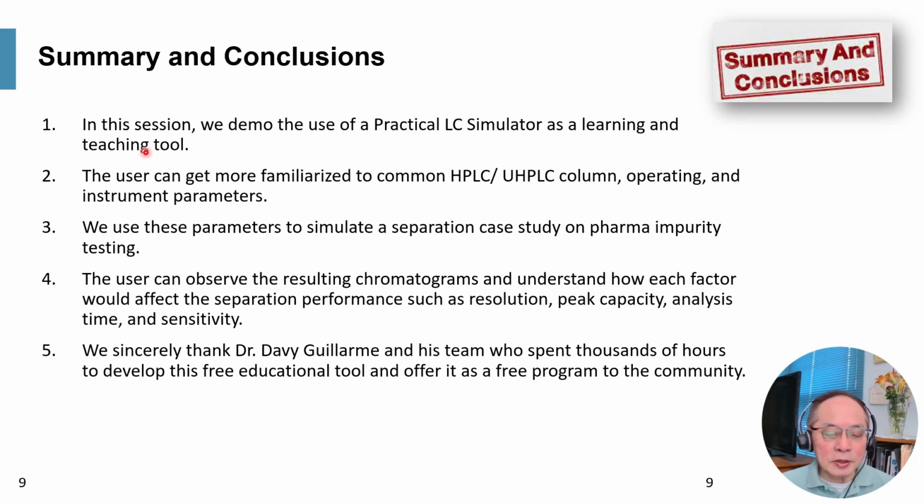Here's my summary and conclusion. In this session, we demoed the use of a practical LC simulator as a learning and teaching tool. The user can become more familiar with common parameters such as column, operating condition, and instrumental parameters. We used the simulation program to simulate a separation case study on pharmaceutical impurity testing. And one can observe the chromatogram and the performance loss, and understand how all these complex factors can have an effect on separation performance, such as resolution, peak capacity, analysis time, and sensitivity.